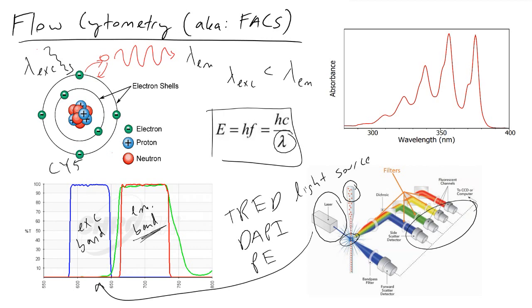as well as Cy5, and there are several others, but basically these are types of fluorophores, and so you can have each one of these detectors, one for T-Red, the other for Cy5, and so on. And so this will help you look at multiple proteins or multiple different aspects or qualities, characteristics of a cell population all in one go.